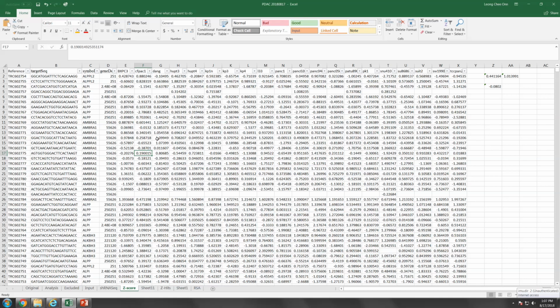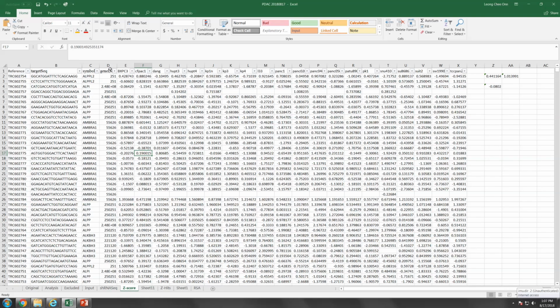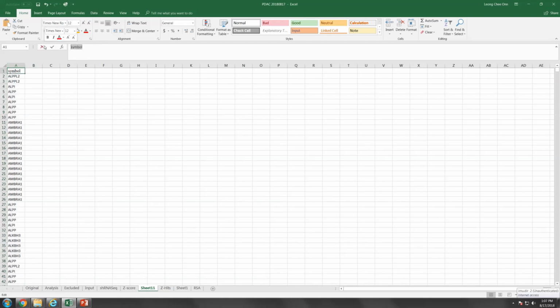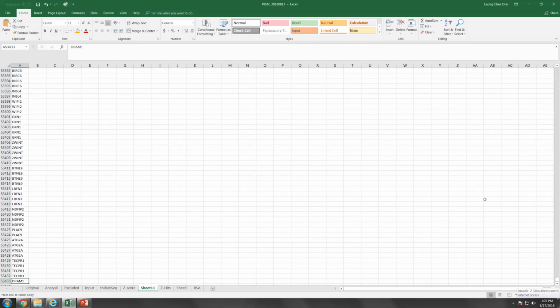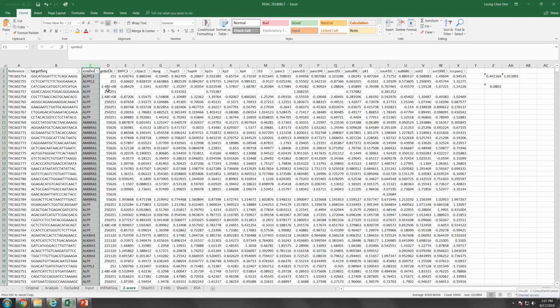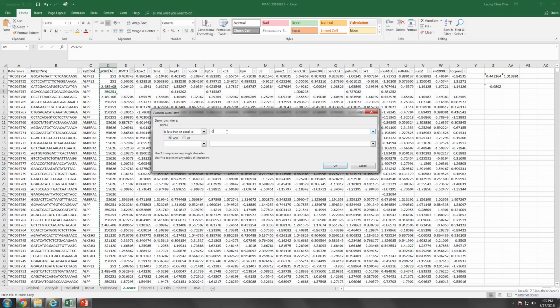But before you do that, I'm going to create another blank Excel sheet and populate all this information. The first thing I want to do is get all the genes and the shRNAs into one column here, and then I will label this. Basically, these are all the genes that are covered under the current shRNA data set. Next, I'm going to filter it. For example, for BXPC3, I'm only interested in the shRNAs that are less than or equal to, say, -2.